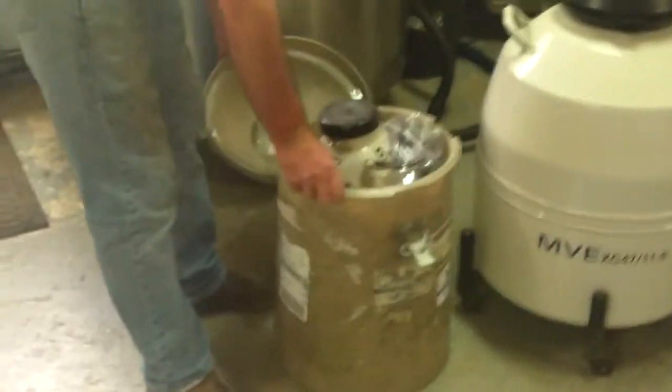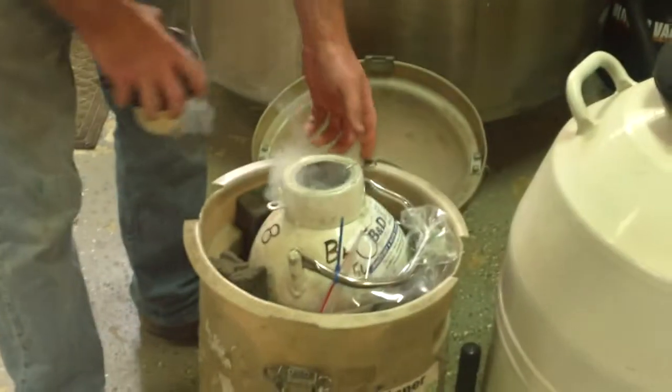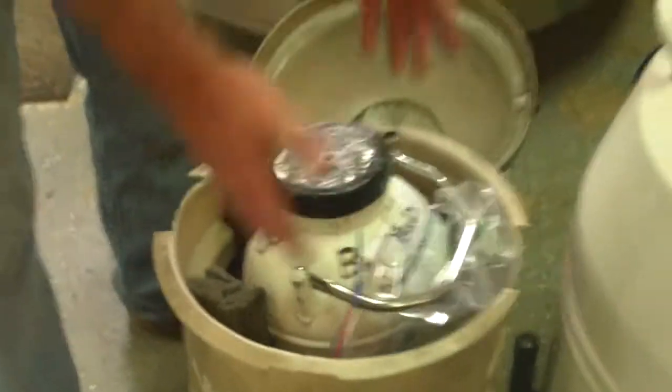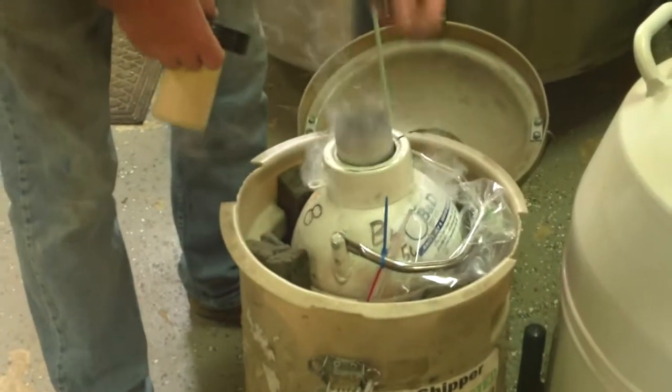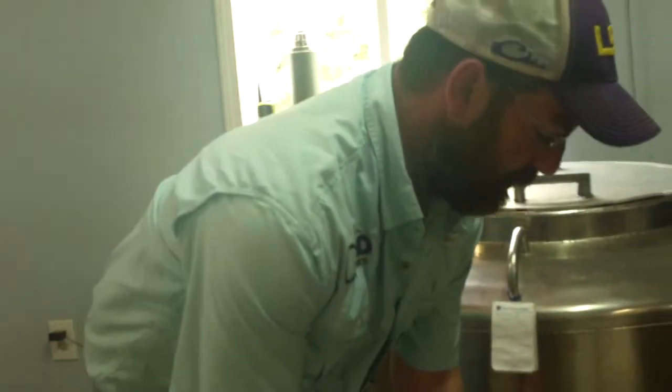This little container here is what's known as a semen shipper. If we ship semen across the country — even across the world — we have to do it in one of these. They're a lot smaller and are what's known as a dry shipper. You put liquid nitrogen in it and it's absorbed through the walls, so it's actually shipped dry. We cannot ship liquid through the mail. However, it still maintains negative 196 Celsius.